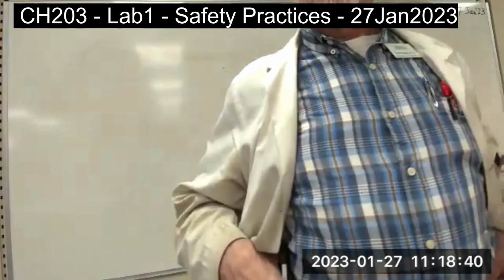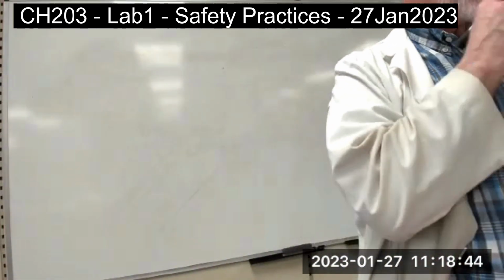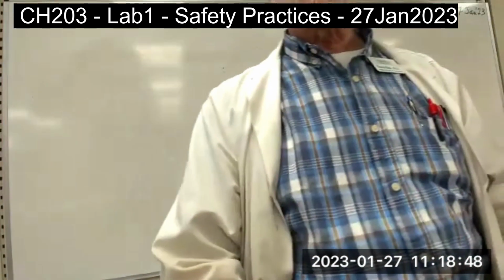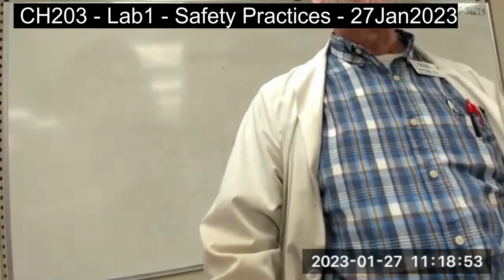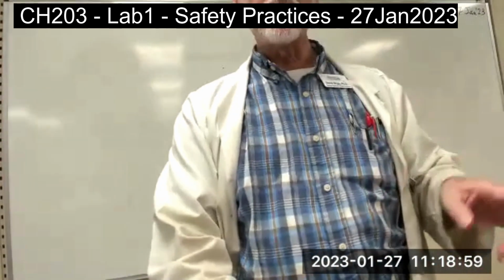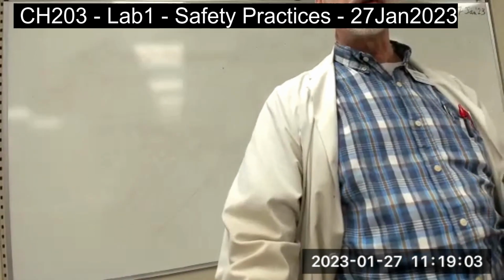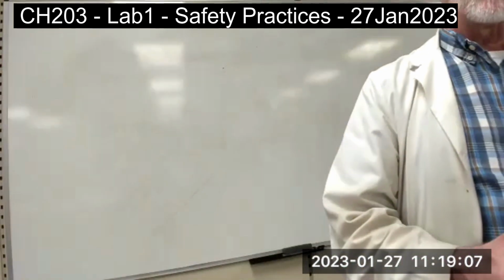Rule number one, know what you're going to do before you walk in the lab. You can get away with coming to a lecture class and never touching the chapter before you hear it in class. I wouldn't advise it, but you can do that, and it won't put anybody at risk. But if you walk into the lab and you don't know what you're going to do, then you put yourself and your neighbors at risk. So preparation is rule number one.